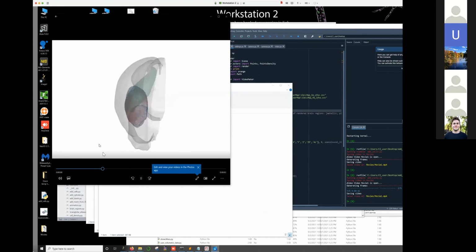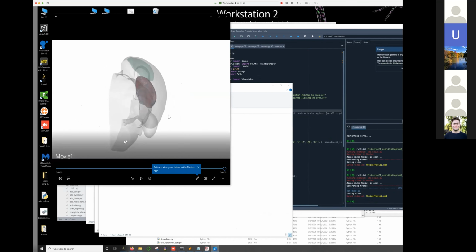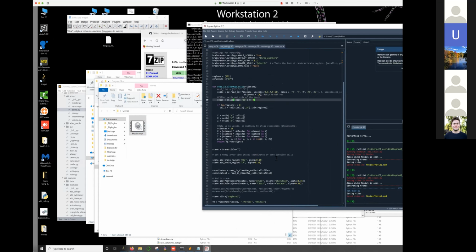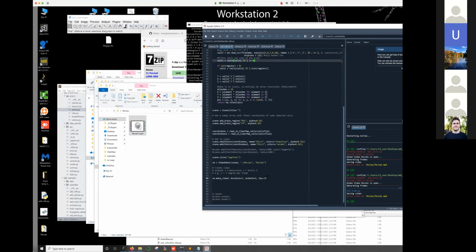my movie here. And obviously, if you're going to make this a little bit nicer, then I would recommend, it's going to take too long for us in this tutorial, but I would put this up to 30 frames per second, and I would put this down to 1, and then your duration will be a little bit longer. But that way you'll have a really nice looking movie that's nice and smooth. So that's how you can do a rotation.